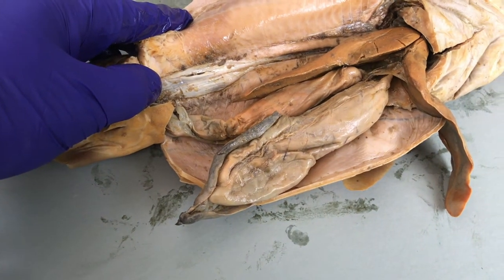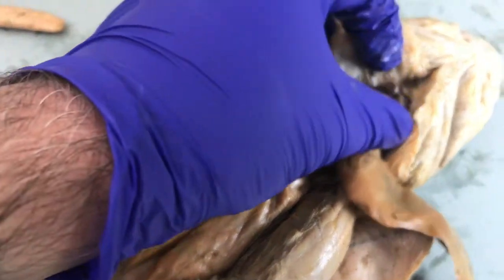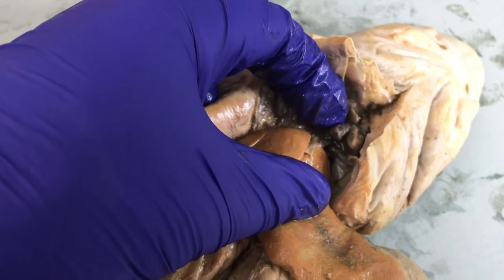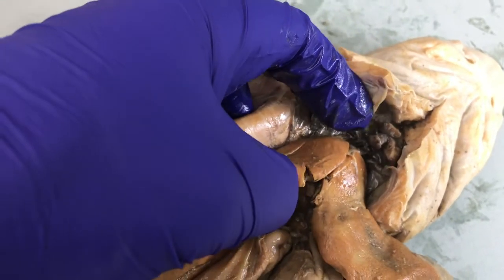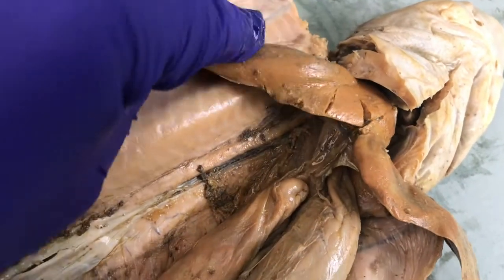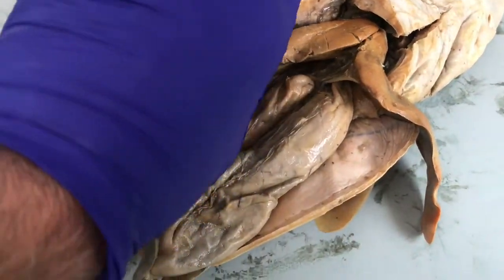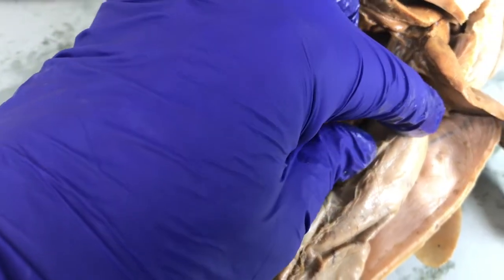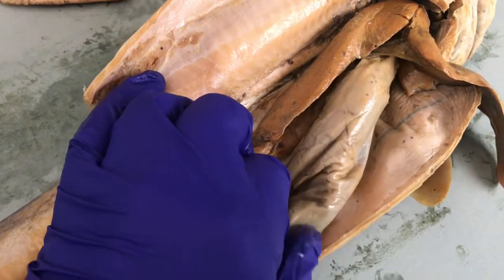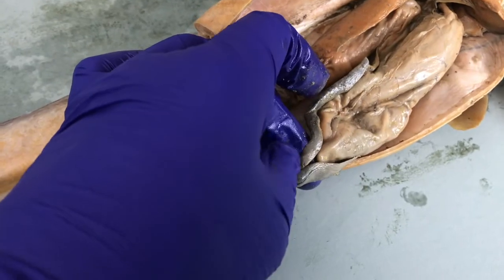Take a little bit of a closer look. Here's a shark been opened up. We have the heart up here. It's a little bit hard to see. It's very dark, but there are two chambers there. If we move down, with the largest multi-lobed organ is the liver. There's one lobe there. There's another lobe off there. Then we see the expanded stomach, because the stomach has something inside, and we're going to open that up in just a second. And then a spleen, a little bit of a spleen down here.